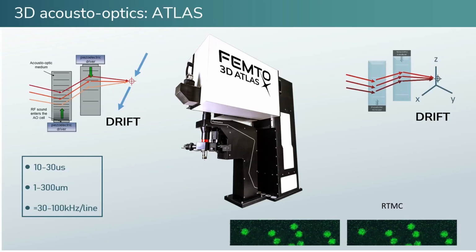What we achieve this speed with, which is required by the nature of the voltage signal, is a special kind of AO scanning technique called drift scan. You see it here in the upper corners, but I also talk about it in detail in an earlier Atlas webinar that you can find at our webpage. There are other pretty informative webinars there too.